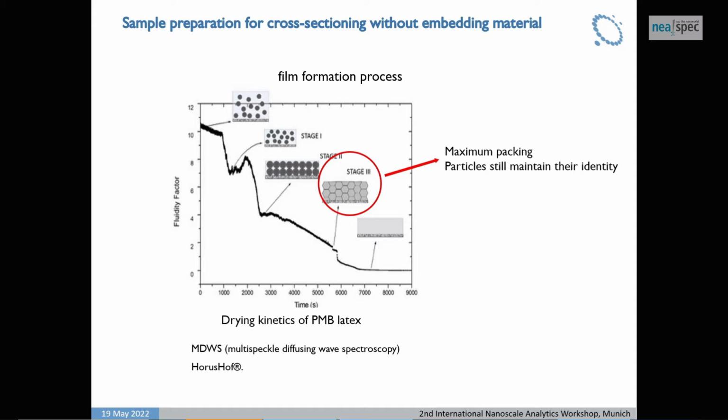To know when this moment happened, we studied the drying kinetics of the PMB latex with multi-speckle diffusing wave spectroscopy that basically measures the Brownian motion of the particles, no? Seeing that, we know that more or less it was happening in 1.5 hours.